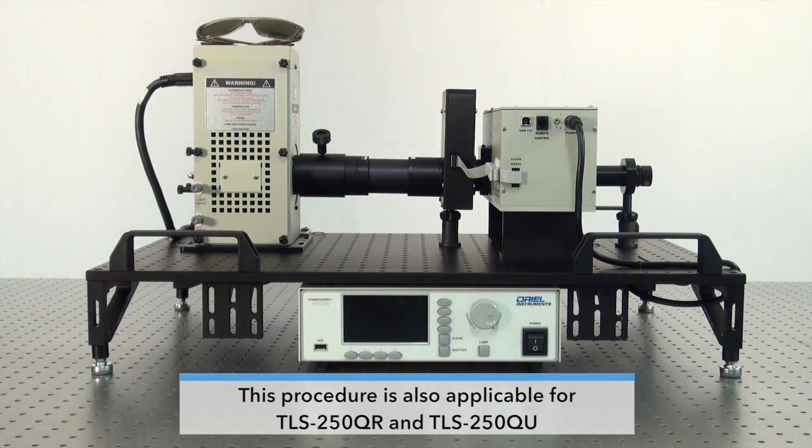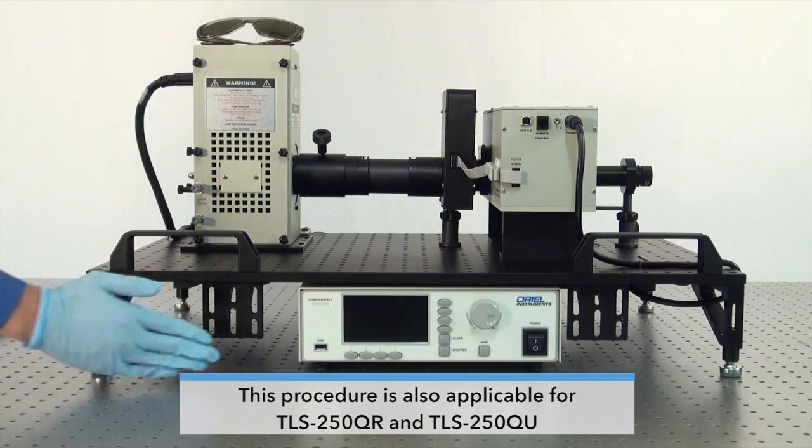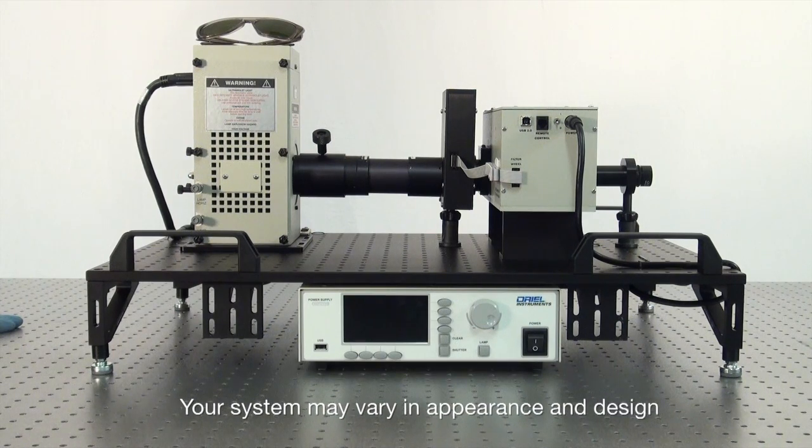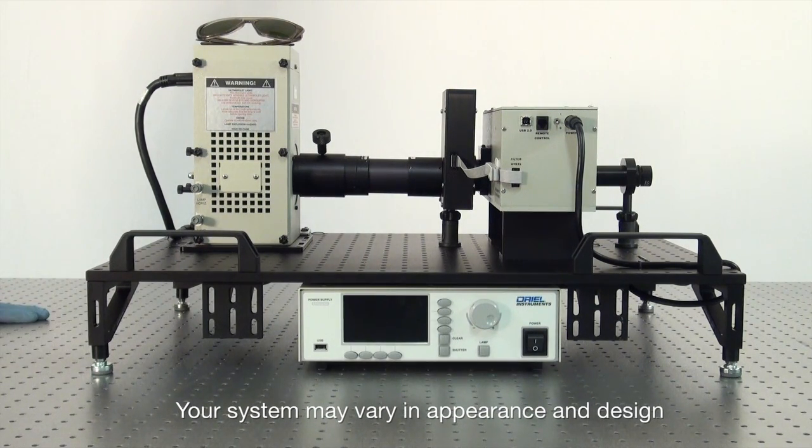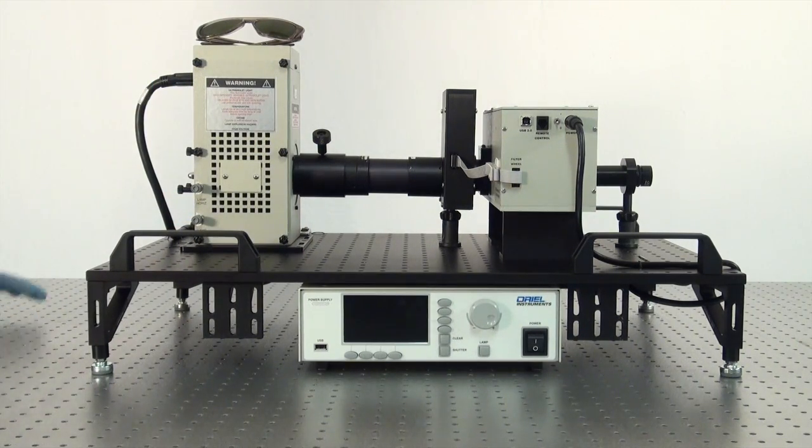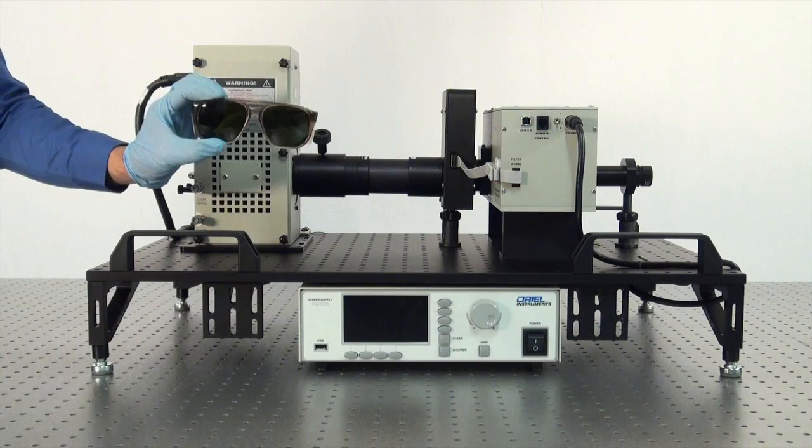Before you begin, it's very important that you follow safety procedures and make sure both the power supply and the monochromator are unplugged and turned off. It's also important that you use the right safety equipment. These are powder-free gloves because you never want to touch a lamp with your bare hands. It's also important to use safety glasses.